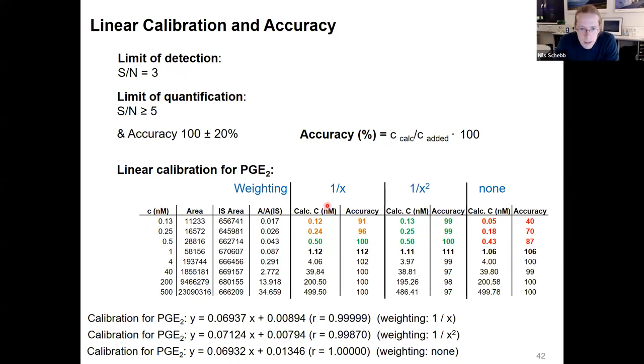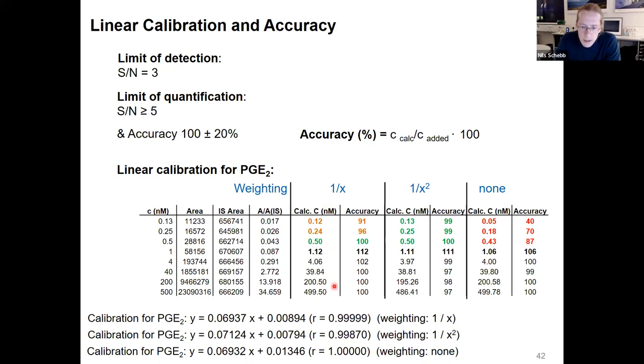This is an example for PGE2: if you don't use any weighting, the accuracy is really bad for low concentrations. But with the same data set, using correct weighting you can easily quantify down to 0.13 nanomolar. It's important to include this kind of data also in your manuscript so you can really show that your calibration works well.